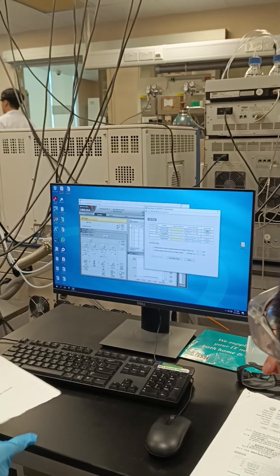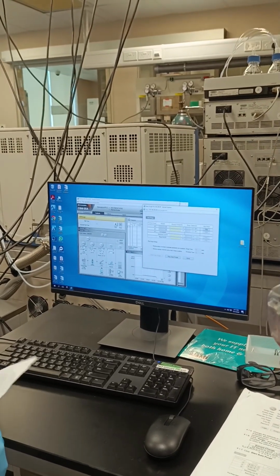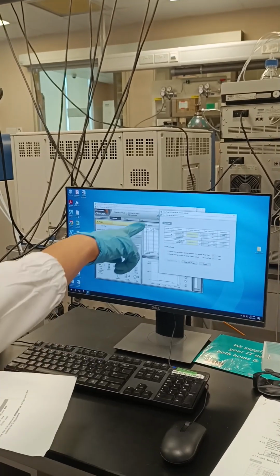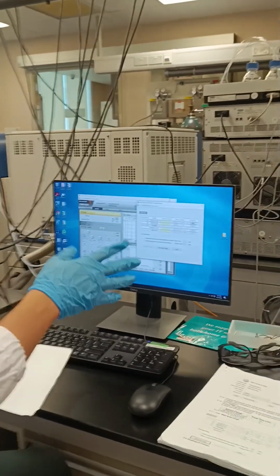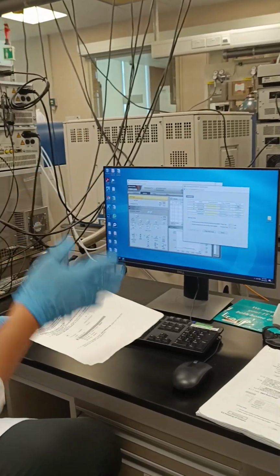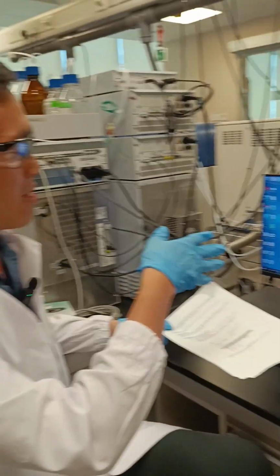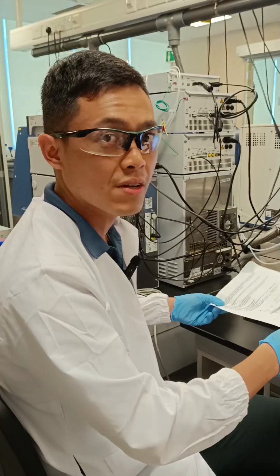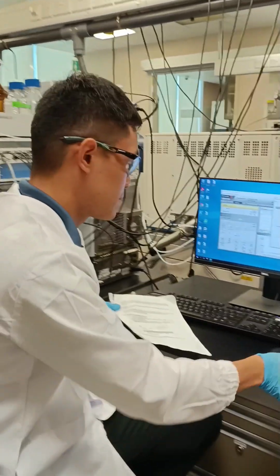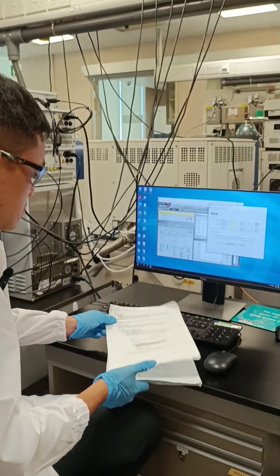I'll just leave it to run on its own. Up to 40 minutes, because 4 times 10, right? So it will take up to 40 minutes. Here you can just take a break. Usually, until this part, I will go do some other stuff. I'm doing sample extraction next door.